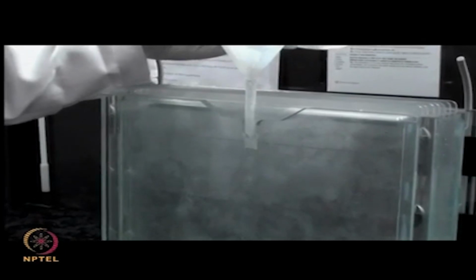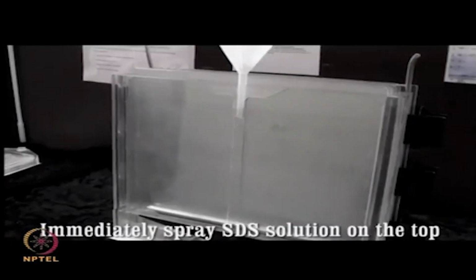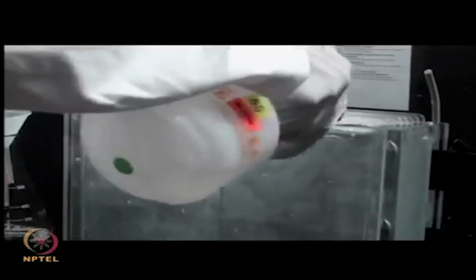Ensure that the solution spreads evenly such that the top edge of the gel is uniform. Allow the solution to stand for polymerization to occur and spray a solution of SDS across the top to ensure that the gel does not become dry.